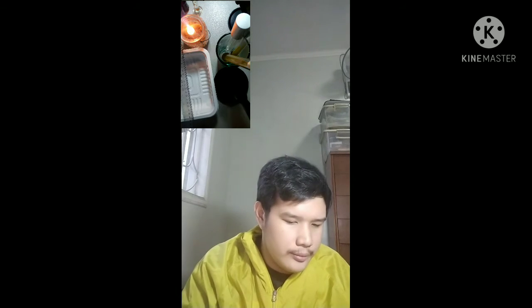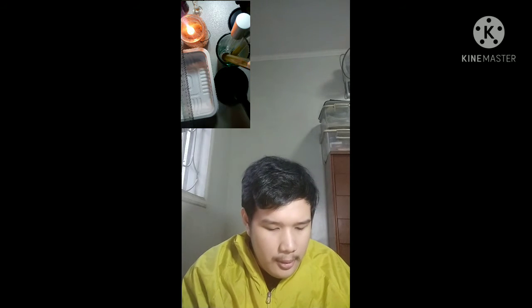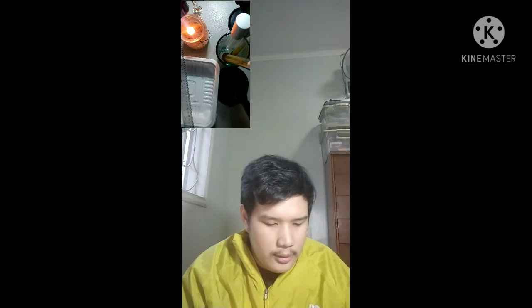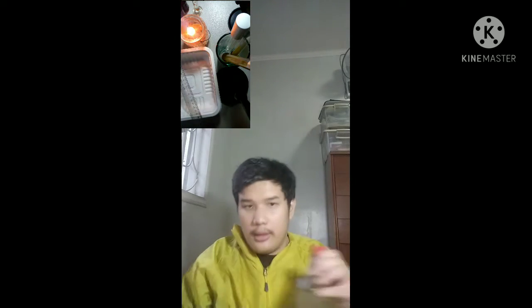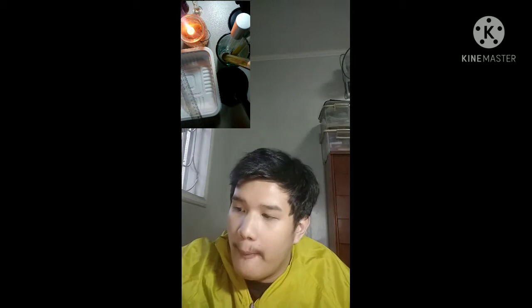These are heat-fixed specimens. You will need a clothespin, but in my case I will be using a pin. Without further ado, let's do this. Oh, also you need water.